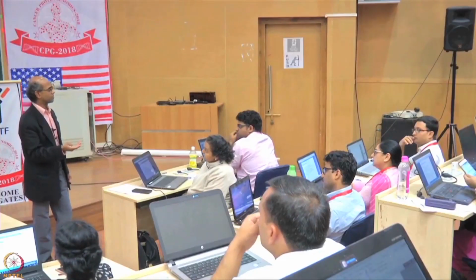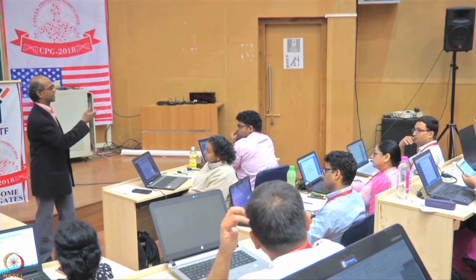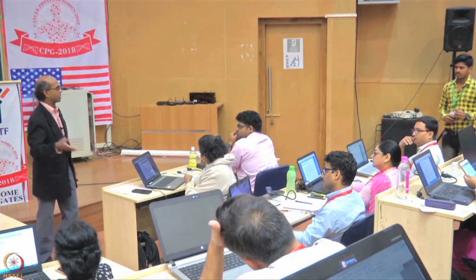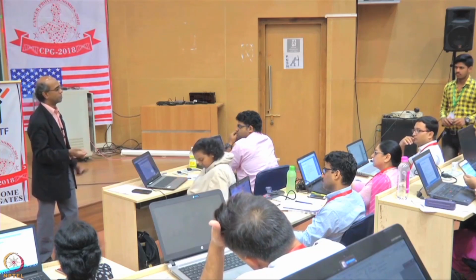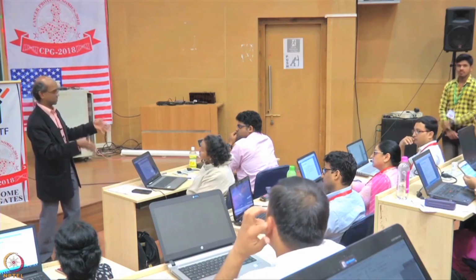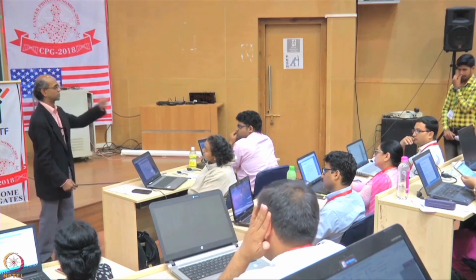You have only 10 samples that you can put on a TMT 10-plex, and then you submitted it and the reviewer came back and said run it 2 more times. So then you can run it 2 more times, you don't need a reference. But if you are doing a study which requires 15 TMT 10-plexes just to do one replicate of the study, then you would have a reference because you have to link the different 10-plexes.